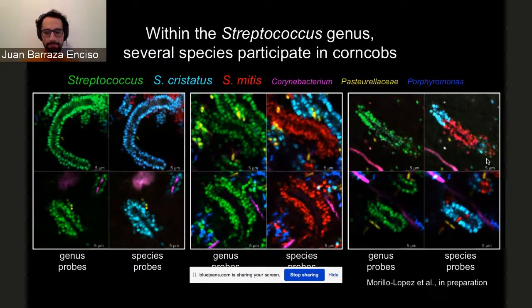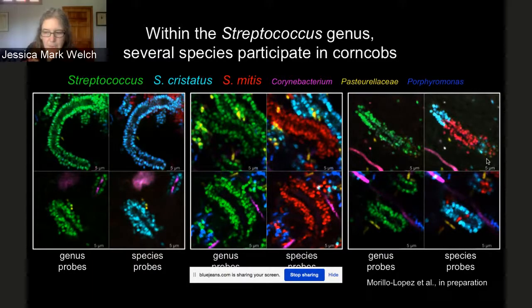So we have found the hedgehog structure. The reason it gets a little complicated is, what exactly do you define as a hedgehog, right? We're looking in plaque, and you see a lot of complexity. If I define hedgehog as it's got the Corynebacterium bush, it's got corn cobs around the outside, and it's got either Fusobacterium or Leptotrichia as that intermediate layer, we have seen that in, I would say, every individual that we've sampled more than once.